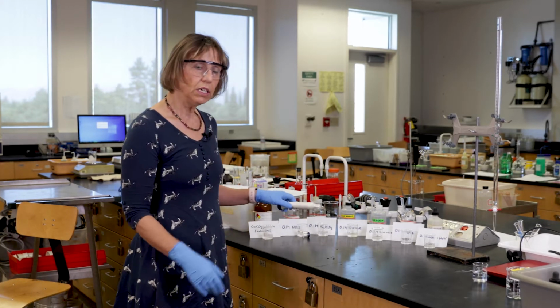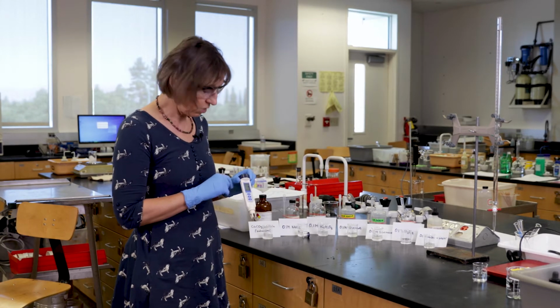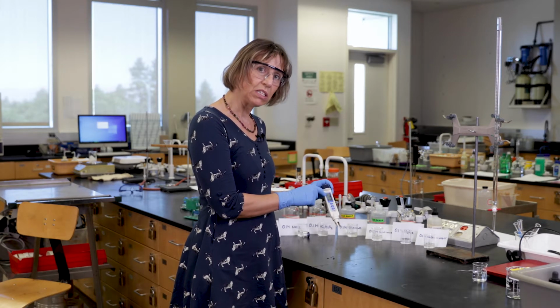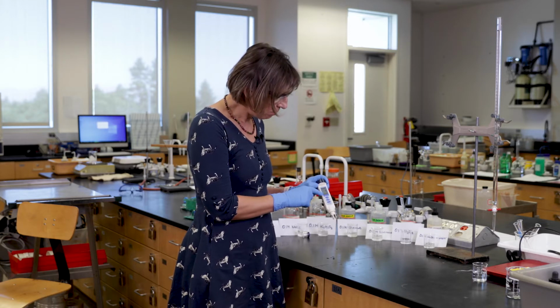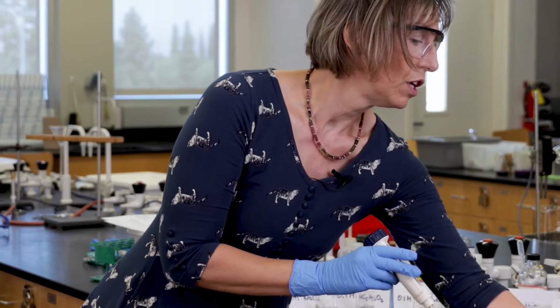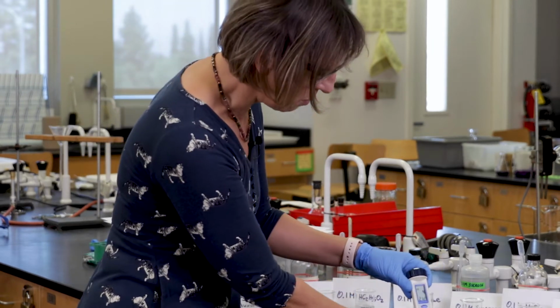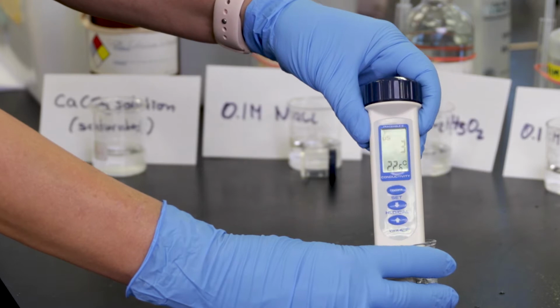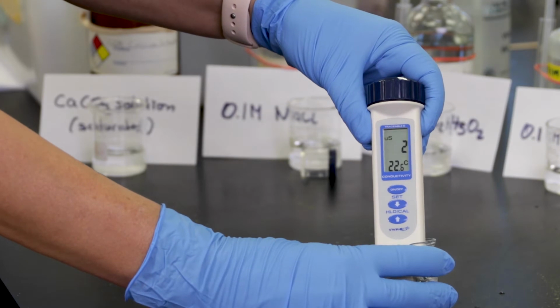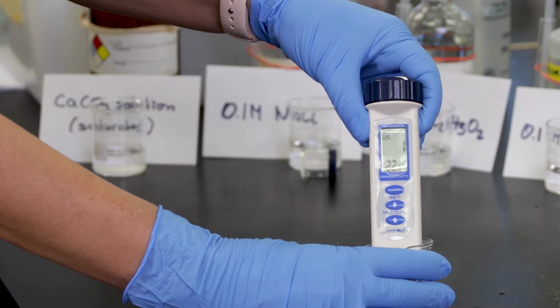So conductivity is being measured with this conductivity meter, and if you look closely here, you will see a scale which is either microsiemens or millisiemens, and then a number below, that's the temperature of the solution. So for example, here I have just DI water, and if I dip this instrument into DI water, we see that the solution is about 22 degrees, and it has a conductivity of 2 microsiemens, or 1 microsiemens even.